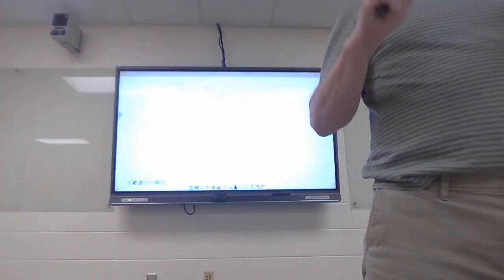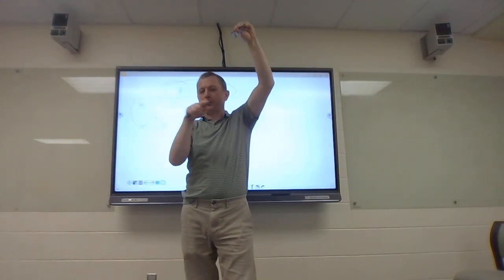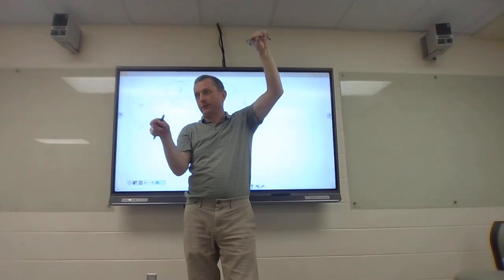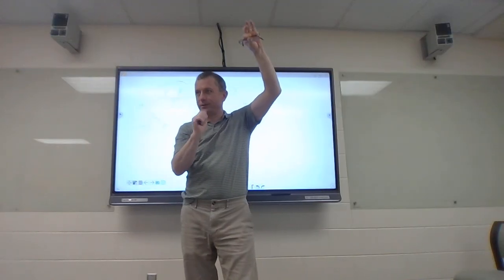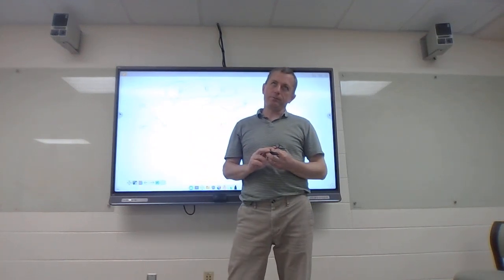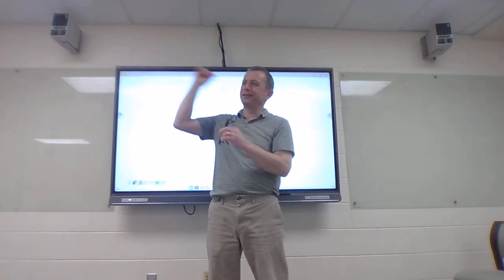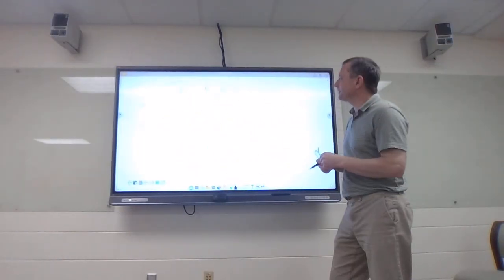Sorry, let me point that out. The numbers above the peaks are the computer program actually giving you what the chemical shifts of each peak are. So it's giving you the literal chemical shift versus you just trying to see it. And then below the peak in this program is the integration. Our program, I think the integration kind of runs off to the side of the peak. And sometimes it's really hard to get to show off, but it'll be there.